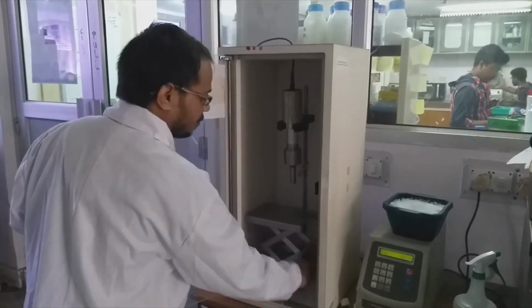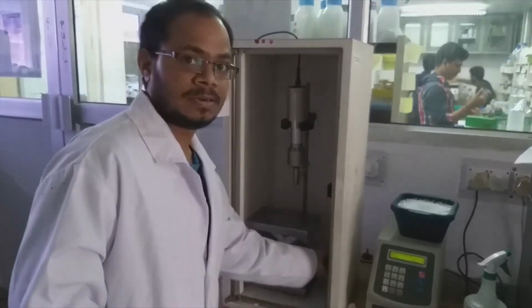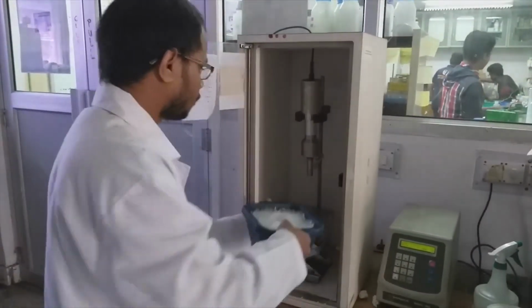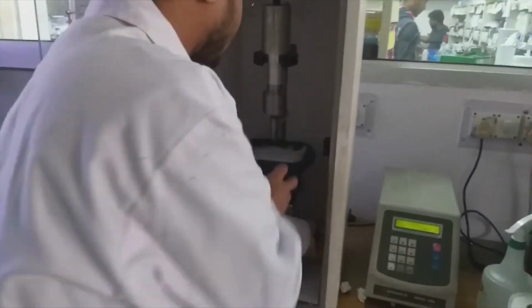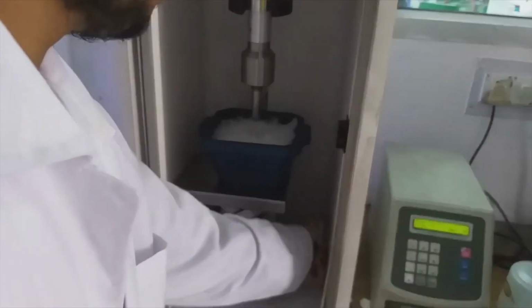This is the jacket where we can adjust the height of the sonicating sample. Once you keep the sample you want to sonicate, you can adjust the height by changing this knob.